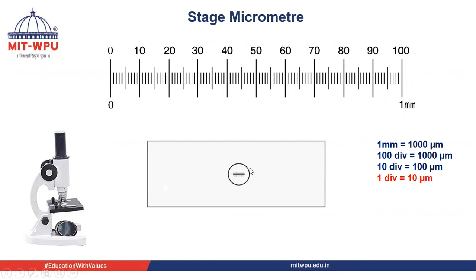We have to keep this stage micrometer on the stage. If we enlarge it, we can see the scale is one millimeter, and there are 100 divisions on this scale. As we know, one millimeter is equal to 1000 micrometers. So 100 divisions equal 1000 micrometers, meaning 10 divisions equal 100 micrometers, and one division is equal to 10 micrometers.